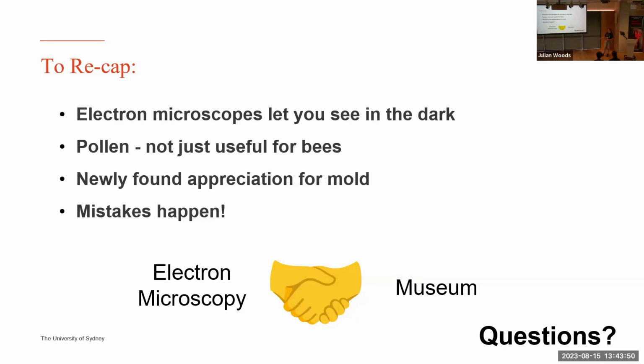And mistakes happen. I'm a student. We love to avoid misidentification. We like to make sure we're sure of ourselves. So electron microscopy, unlike our light microscopy, can actually give us that certainty and eliminate bias. So yeah, I hope I showed you today that physics and museums should collaborate more often, and there's way more to get out of electron microscopy than meets the eye.